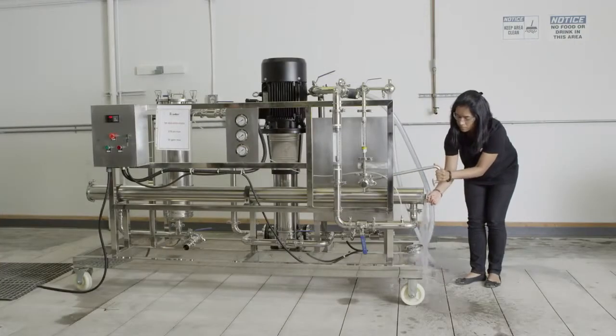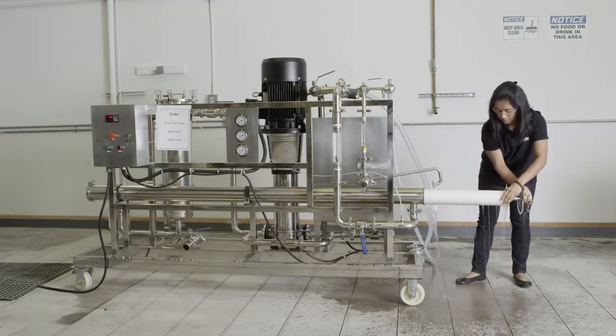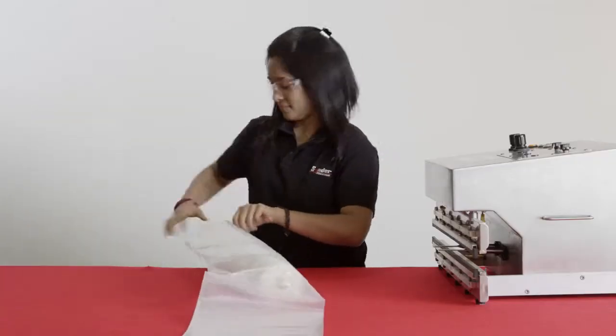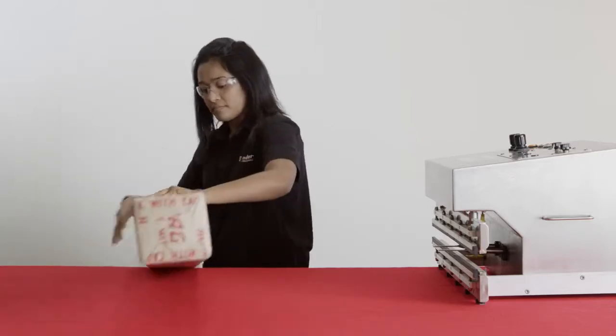Remove the element from the housing after the preservative rinse. Drain off excess preservative. This is a good time to check the pH. Place the element inside a poly bag, vacuum seal it, and box it up.